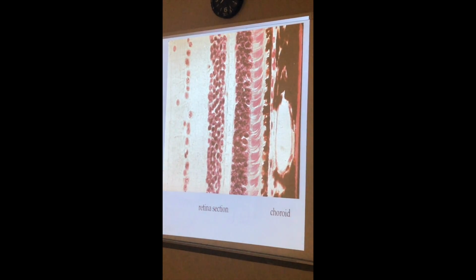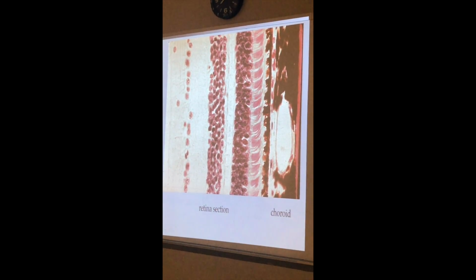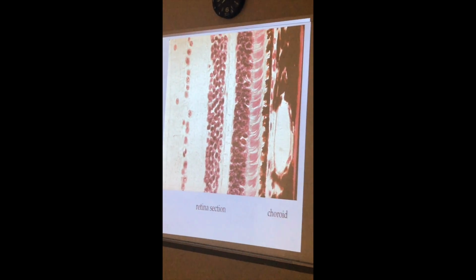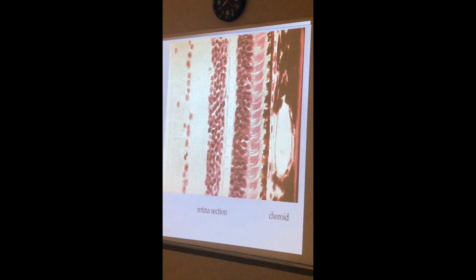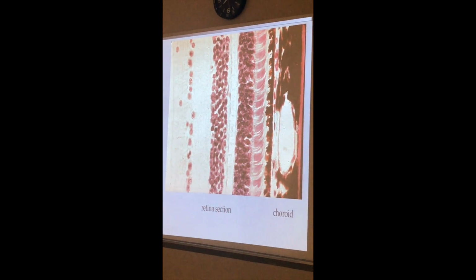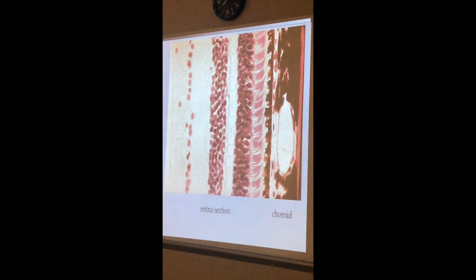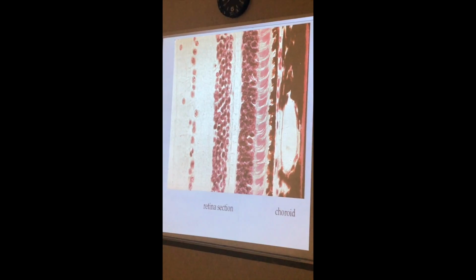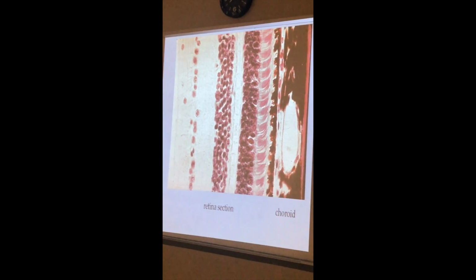As it gets excited, it then sends the axon over here to the dendrite over here, and this is the nuclei of the bipolar cells. We finally see these bipolar cells. We've heard enough about them. I forget, do bipolar cells have Schwann cells or not? Do they have a myelin sheath or not? They don't have a myelin sheath. They don't need it. See how close it is. It's not like it's going from your spinal cord to your big toe. That's a long distance. This is not so far. It doesn't need it. So it's gone through the photoreceptive layer to the bipolar layer. This is called the ganglion layer, and then they send the message on out.